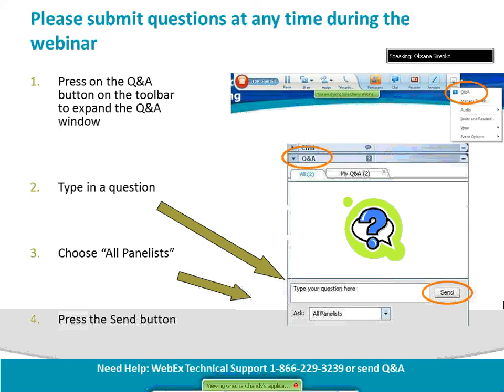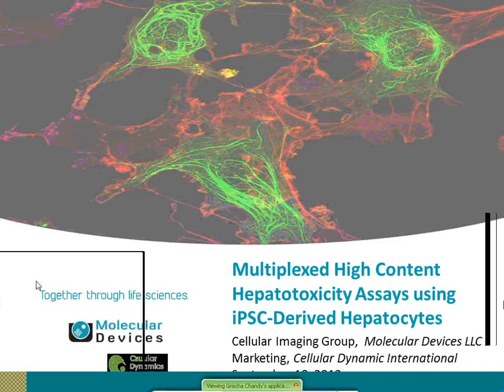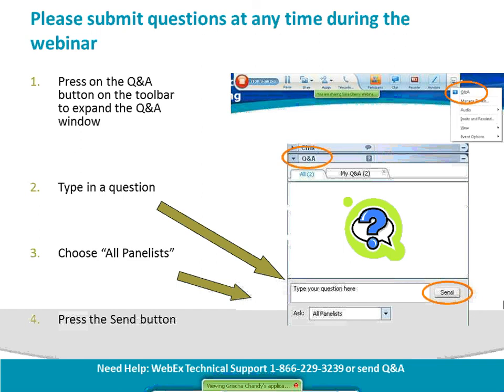In our assay, which is actually not a high throughput development but more of an assay development effort, we usually have a number of DMSO controls on our plate, at least 20 wells, and we have some compounds which we expect to have toxicity, so we have at least 10 different wells with cytotoxic compounds.